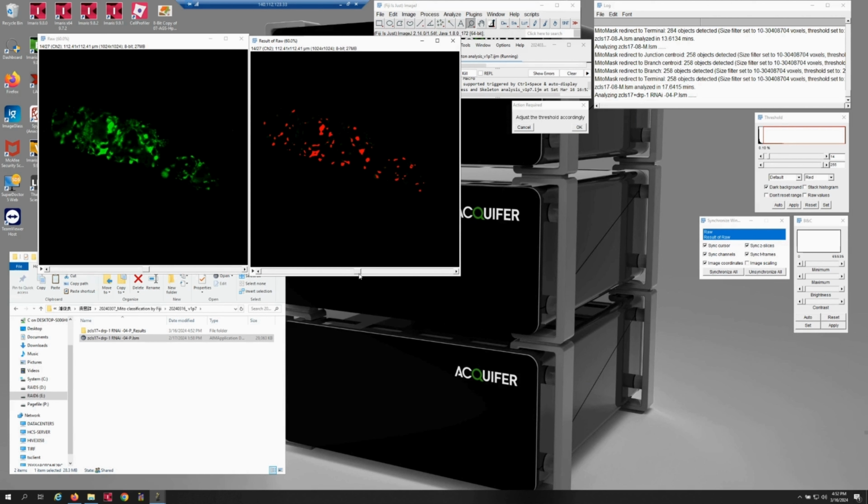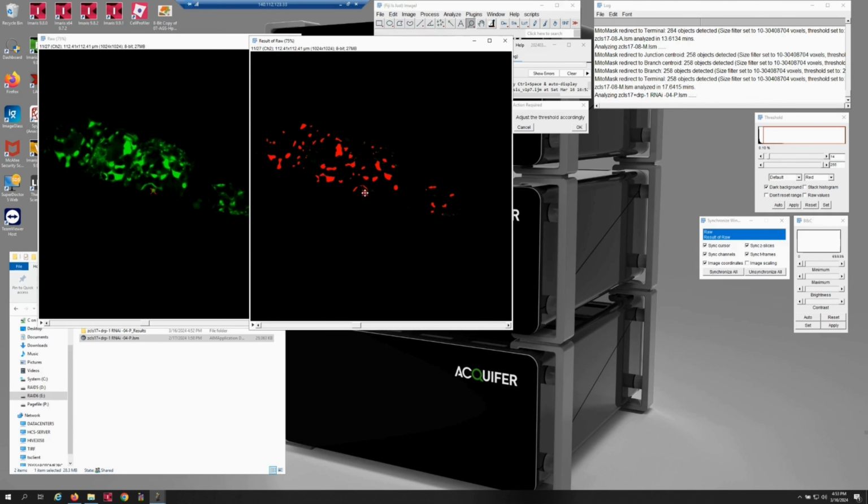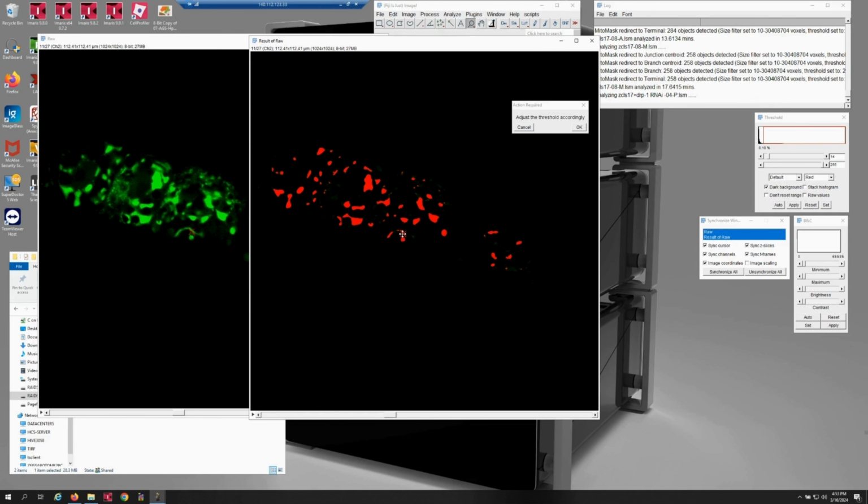So where do I focus? We actually focus on lines like this one, because in the raw data it should be connected. However, in this segmentation, in the subsequent binary setting, you'll notice that no matter which layer I pull to, it always gets disconnected. So, this indicates that our current parameters are too strict. Thus, the image intensities aren't able to connect properly.